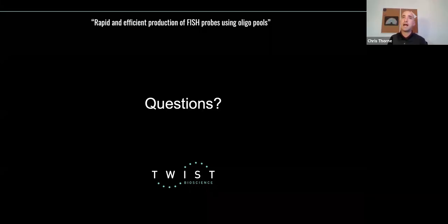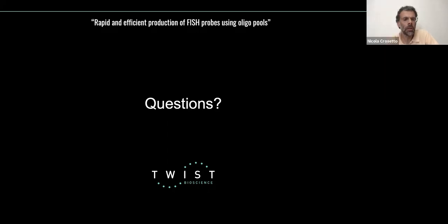In terms of how large you can go, you talked about designing sets across the whole chromosome. So there is a question as well about what's the largest size you could design by IFISH. We showed already in the paper that we compared chromosome spotting containing a lower or a larger number of probes, so every 5 megabases versus every 1-2 megabases. We are now actually designing probes every 1 megabase along all the human chromosomes.